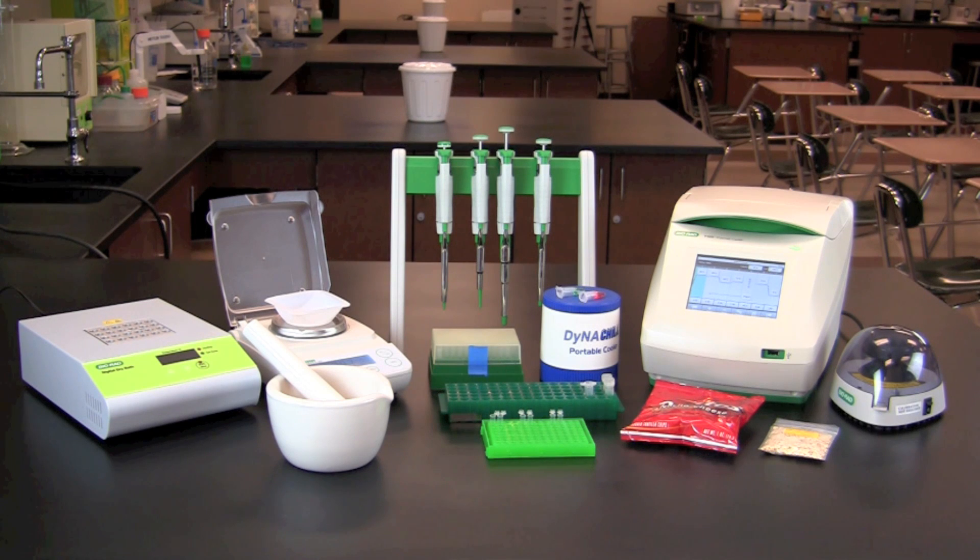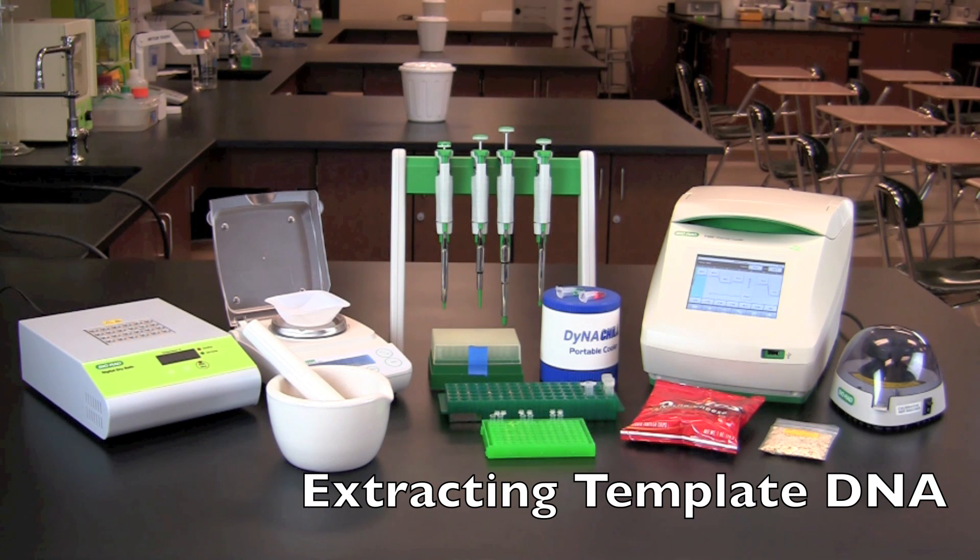In this video you will learn how to perform detection of genetically modified organisms or GMOs by PCR. This activity will allow you to determine whether foods purchased from the grocery store contain genetically modified or GM crops.